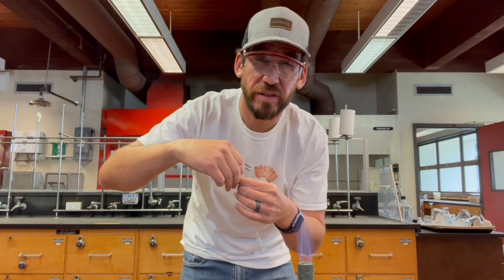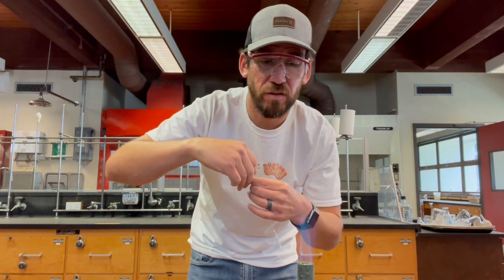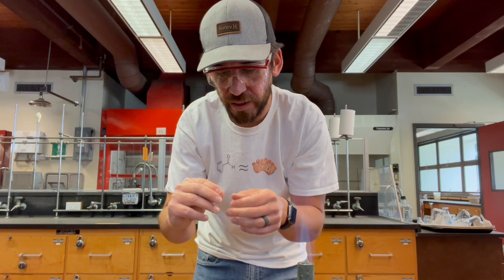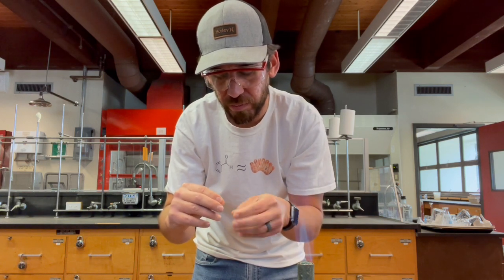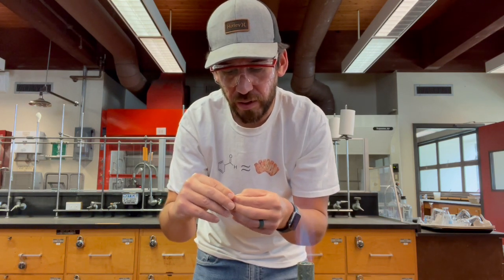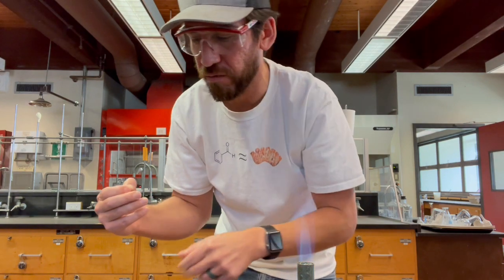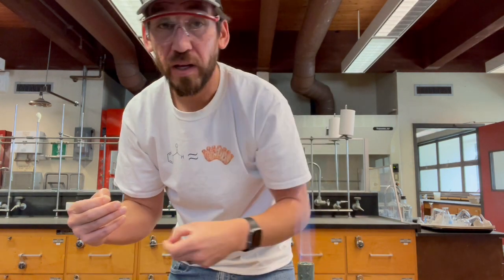You could use some glass cutters or whatever, but I do this instead because I'm careful and it's me. If you were here, I would have you cut it off instead of using your hands, because then you get tiny shards of glass everywhere and also in your hand. I don't want you to do that.